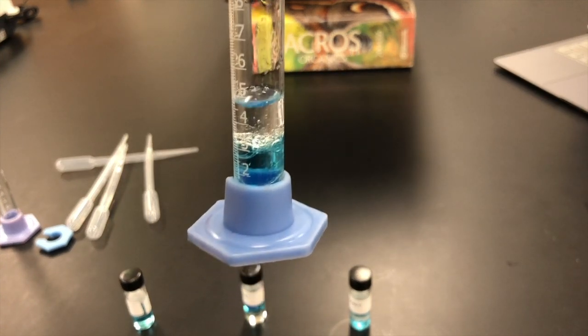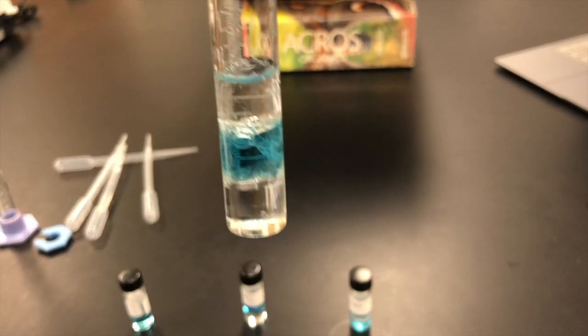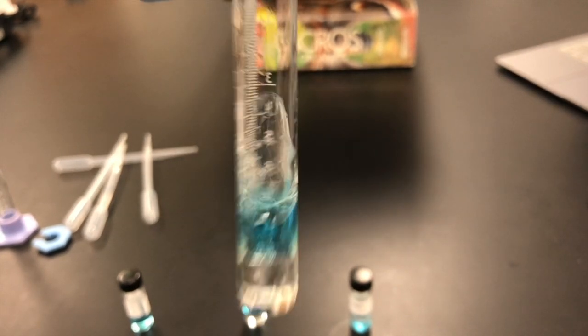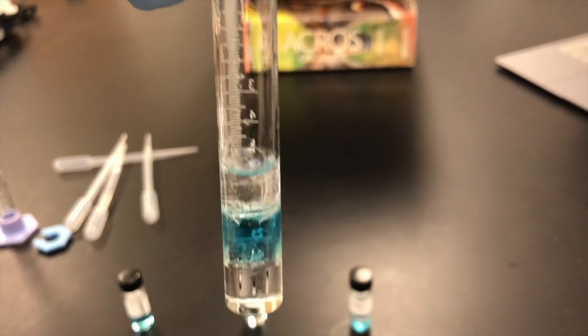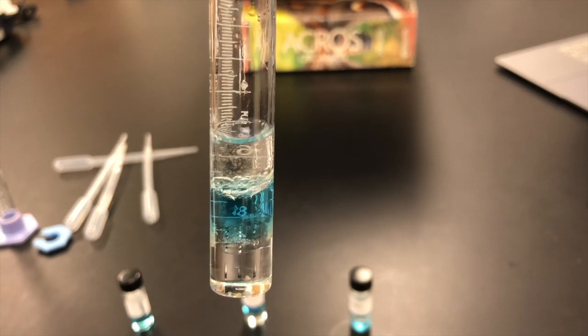Write your observation as to what happened. And the water in this particular case is blue. We put some dye, food coloring in the water.